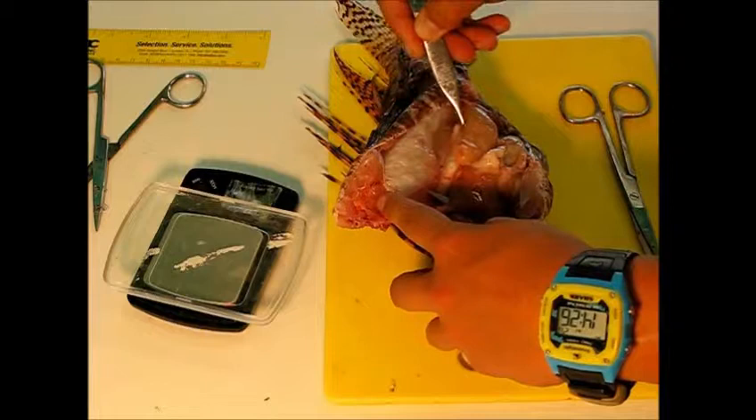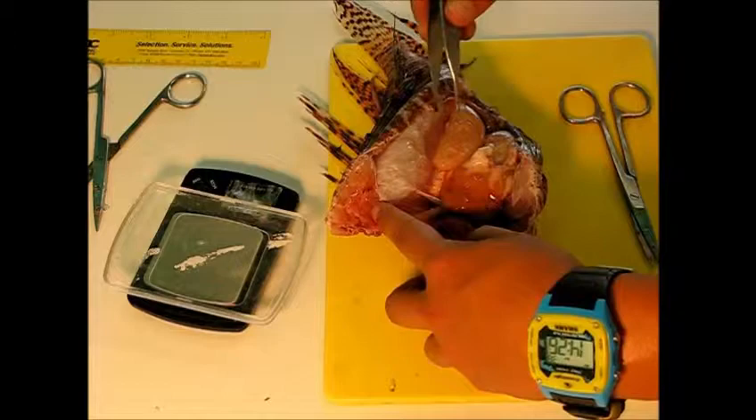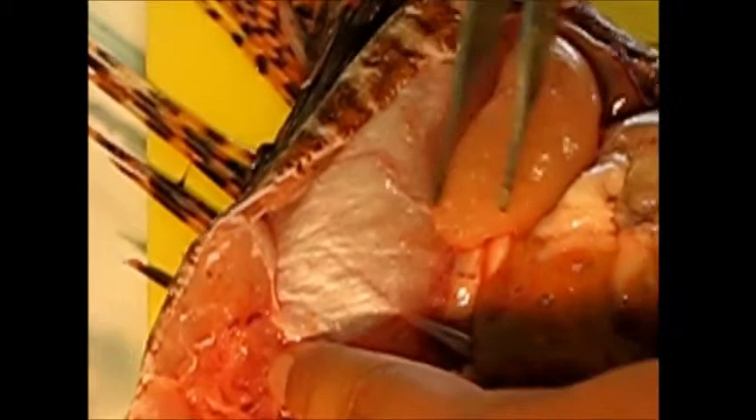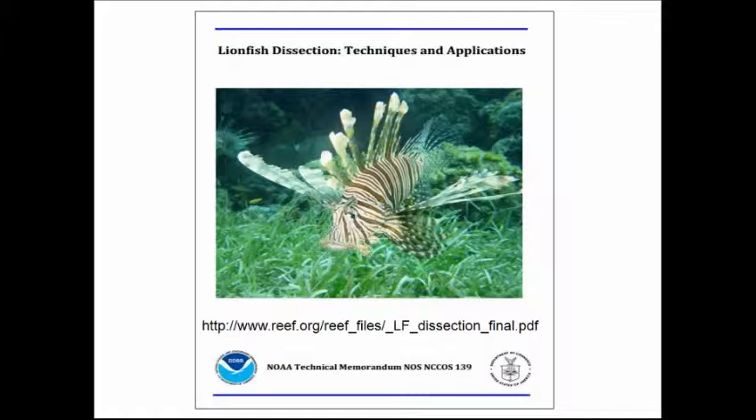In order to sex the fish, you need to look at the gonads, which often are lying right on top of the swim bladder. This is a female, and for females we have four different stages for the gonads that can indicate their reproductive stage. This is an F2 female — you can't see individual eggs, but the ovaries are a cream color and are much larger than the F1 stage. Next is F3 and then F4. Complete gonad staging can be found in the NOAA technical memorandum on lionfish dissections, which includes information for two male stages and four female stages.